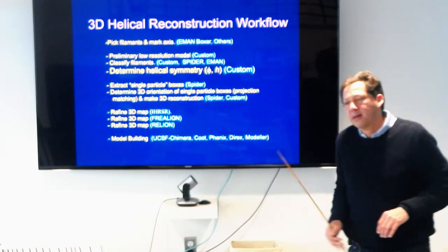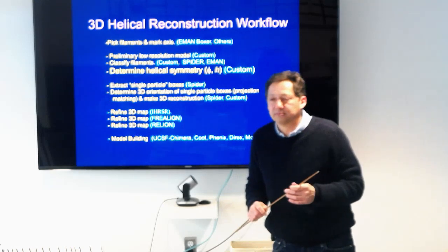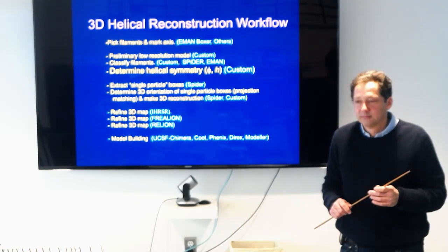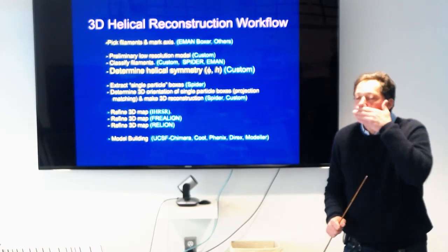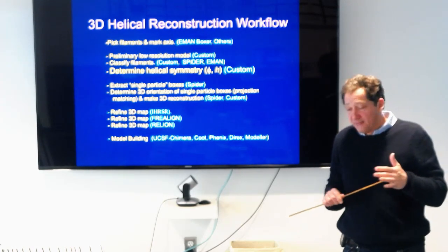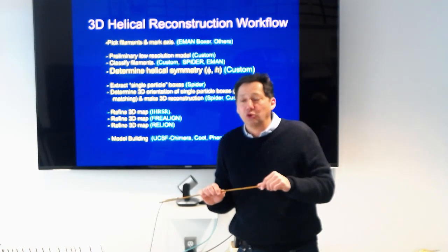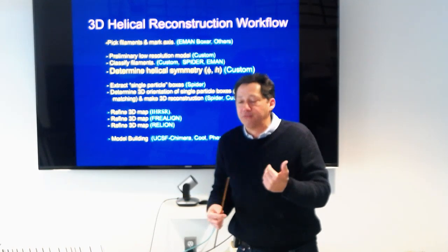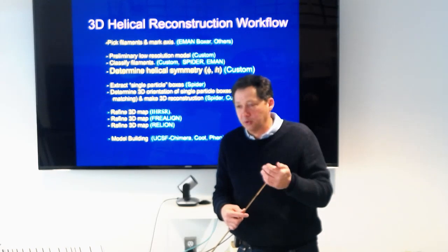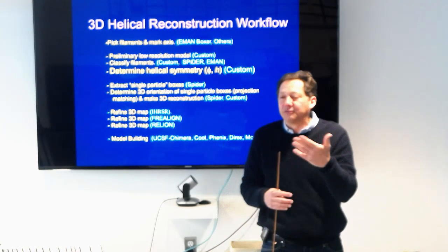Yes. When you have that case, would it be equivalent to thinking about if you just double the rise and double the rotation, it'll give you the same helix? You could do that. Yeah, you definitely could do that, but you may lose information when you do that. But yeah, that's the kind of thing that you think about.